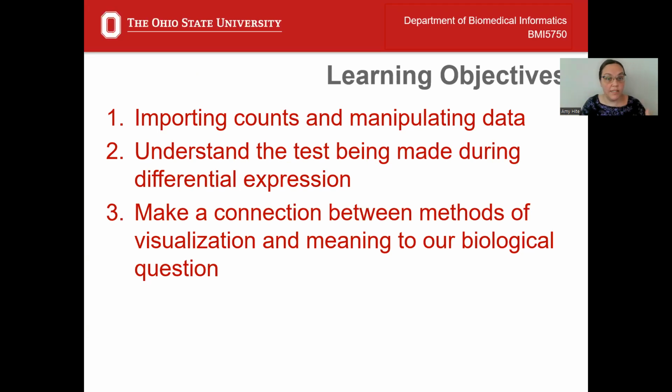We're going to see here how to import your counts and manipulate those tables into a form that we need to do differential expression. We're going to describe the tests and why we do certain things to do this differential expression statistical test. We're going to look at our different methods of visualization and understand how we can find biological meaning from those plots, from the visuals.